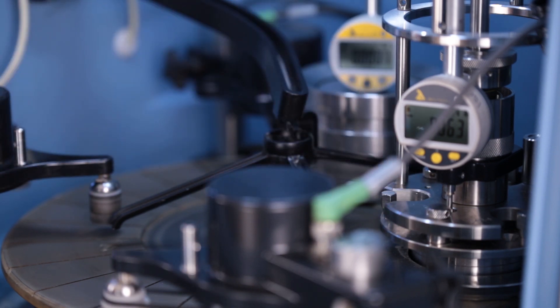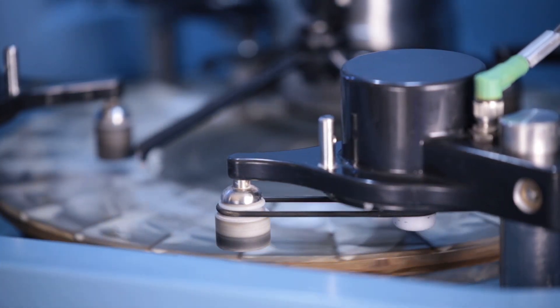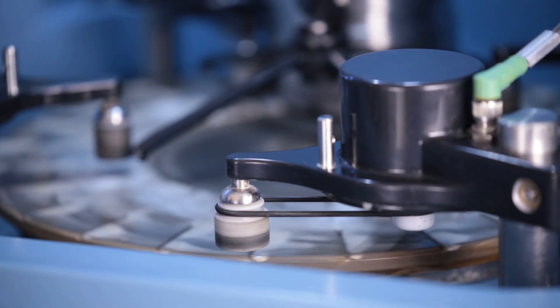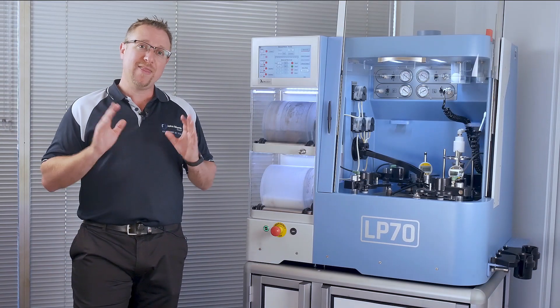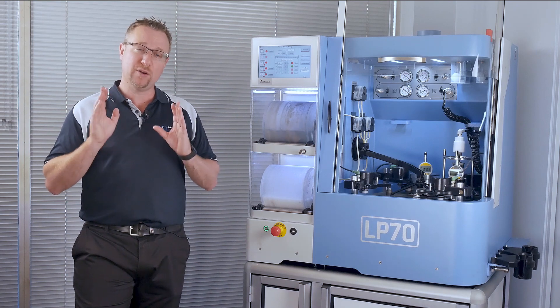This system comprises of the lapping or polishing plate itself, which can run from between 5 to 100 RPM. The precision lapping and polishing jigs, which there are many options to choose from, and they in themselves run independently between 5 and 100 RPM using the driven roller arm technology.